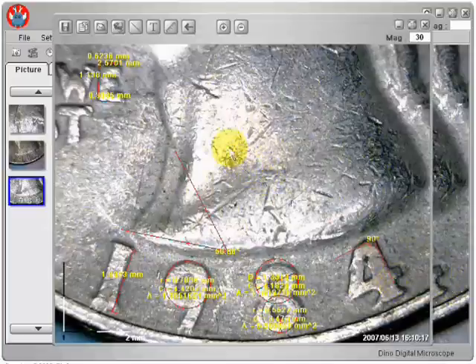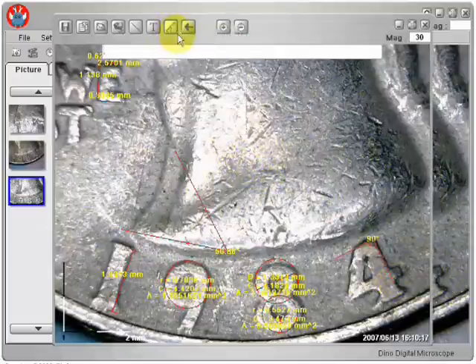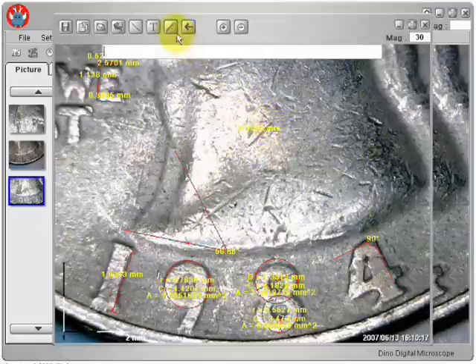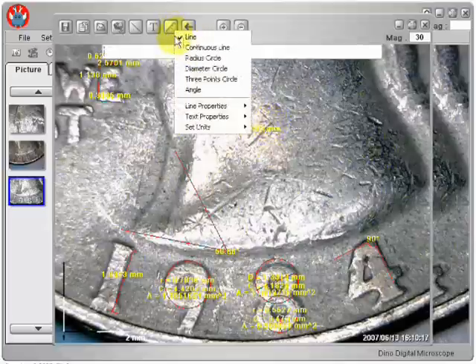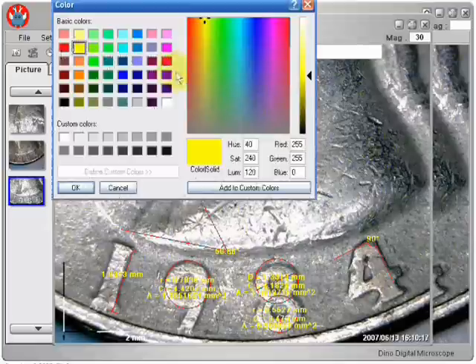If the letters are too hard to read, you can change the font, color, size of the letters and also choose different line styles. For example, I will change the font color to blue.